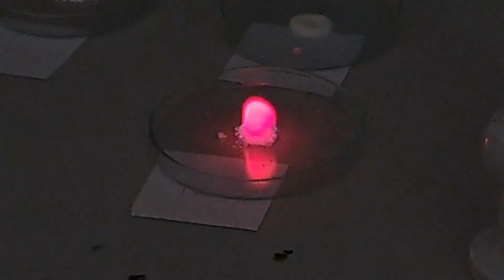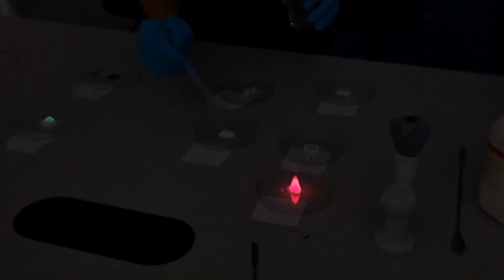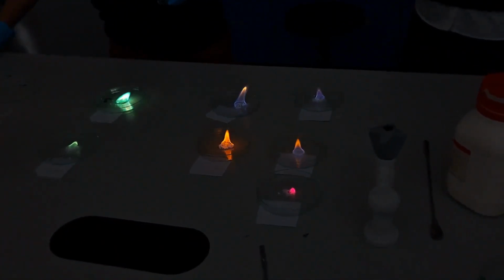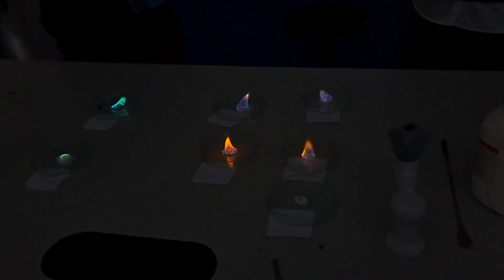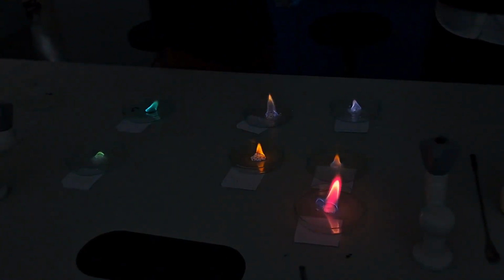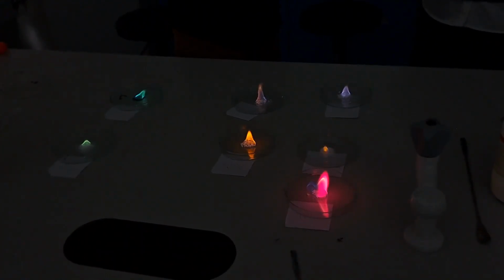Let's light everything up together. No, the pink one. Okay, let's give you too much ethanol. That is lithium chloride, sodium chloride, and potassium chloride from the same group.